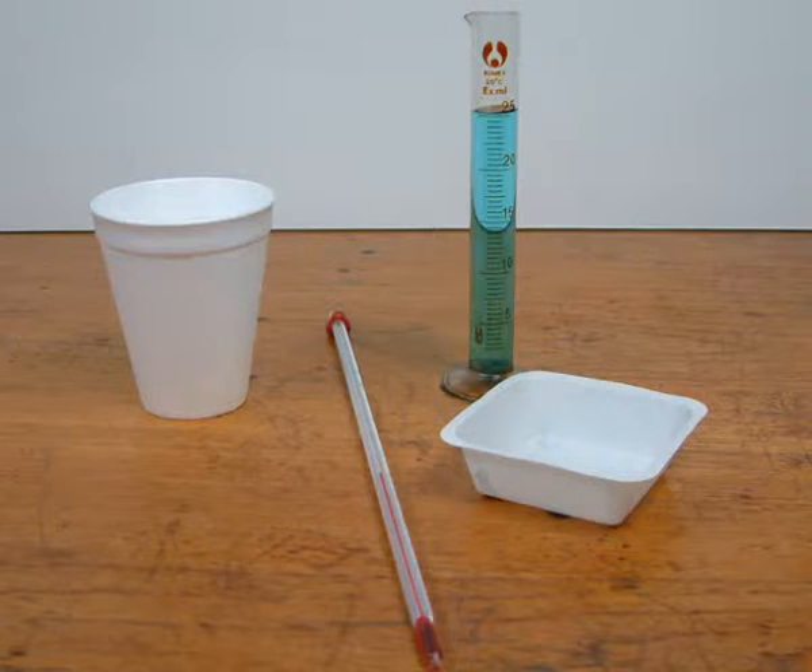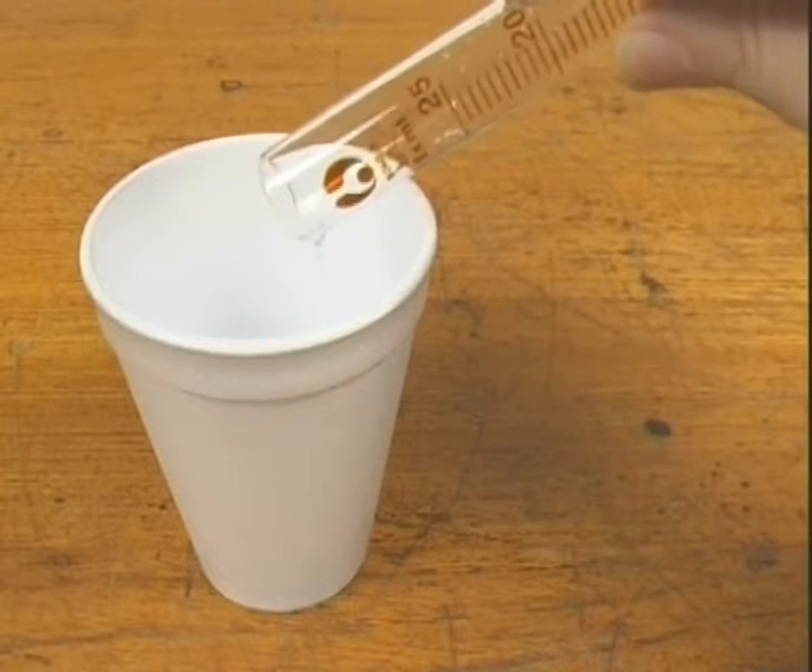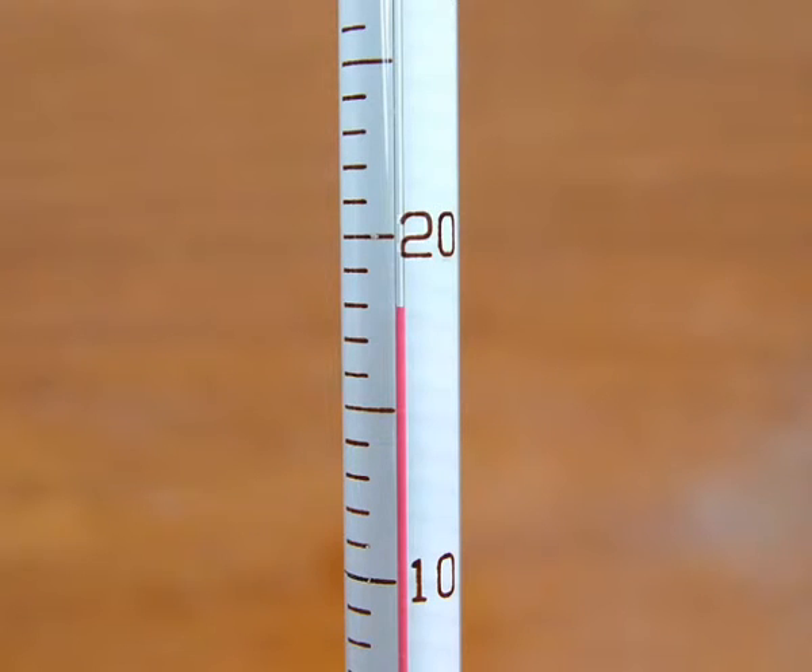A polystyrene cup was used as a calorimeter. 25 cubic centimeters of 0.2 molar copper 2 sulfate solution was placed in the cup and its temperature was measured. Make a note of the starting temperature.